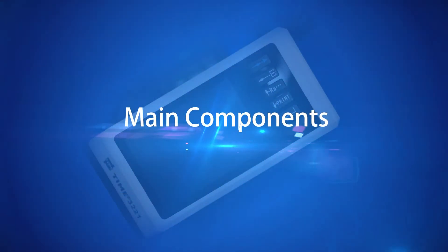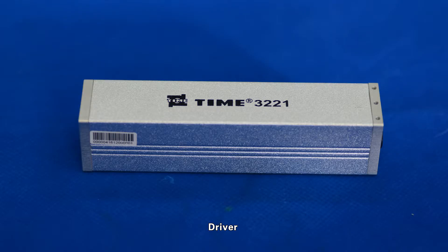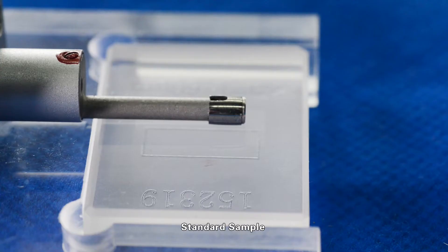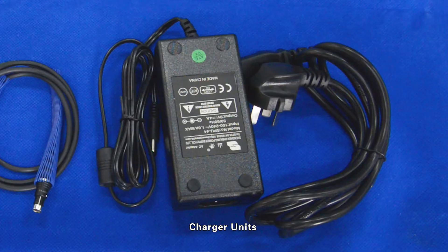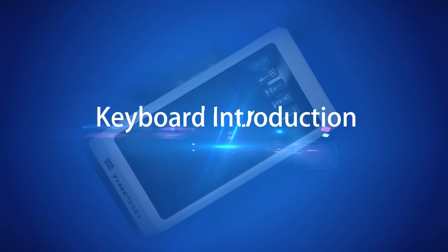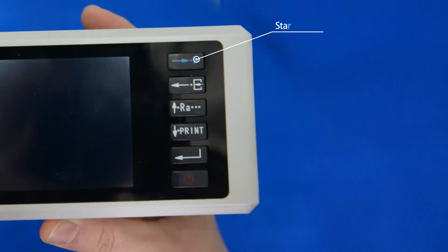Main components include: main unit, driver, communication cable, pickup, standard sample, magnetic base, charger units, sample locator, and keyboard. Key interface elements include: startup key, menu key, display key, print key, enter key, and power key.